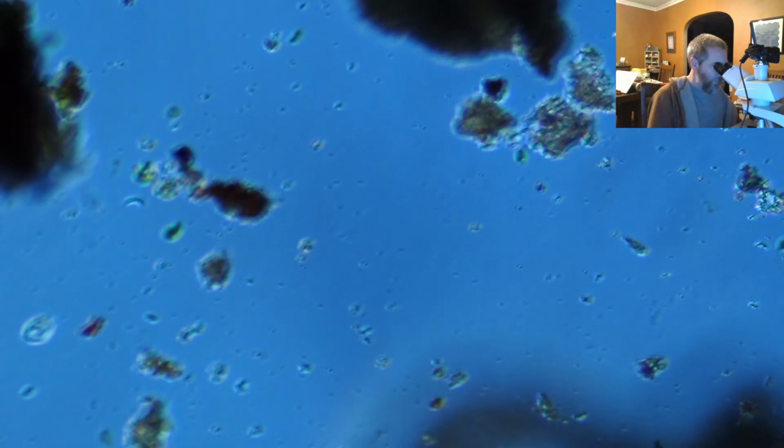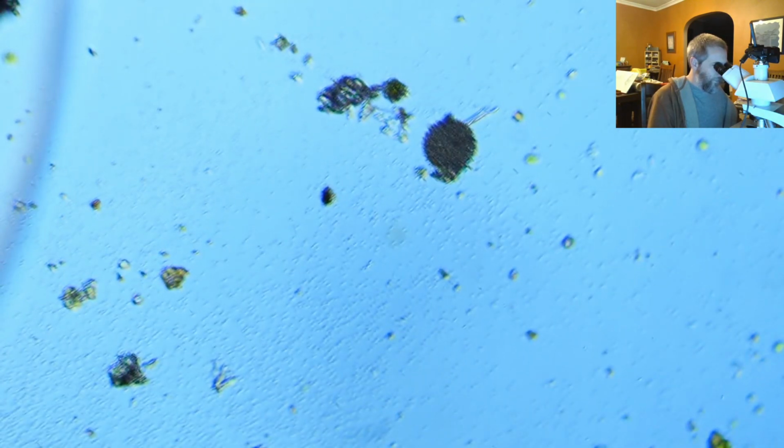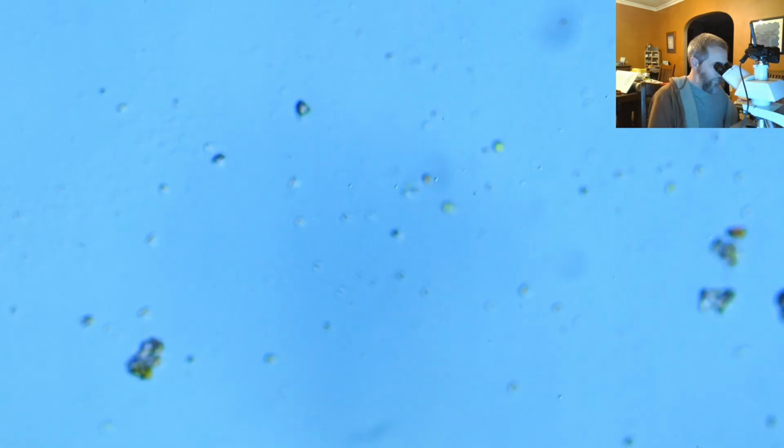I've seen some videos on YouTube where a guy who was looking at them showed the mother, in some cases, I don't know if they give live birth, but she had a bunch of little baby water bears around her. Sometimes their eggs look like these, or the rotifer eggs look like these little round things right here. I'm not sure what else those could be. They might be rotifer eggs.